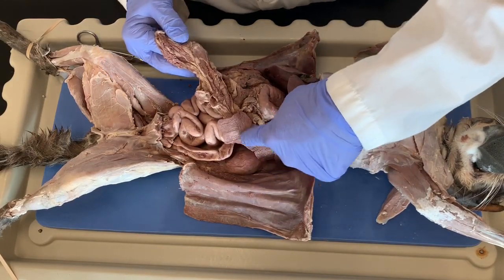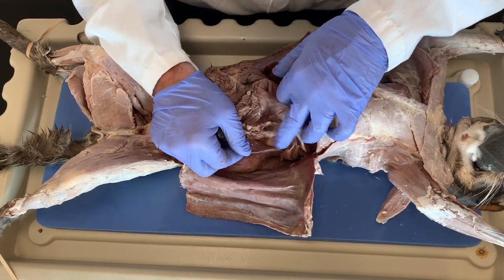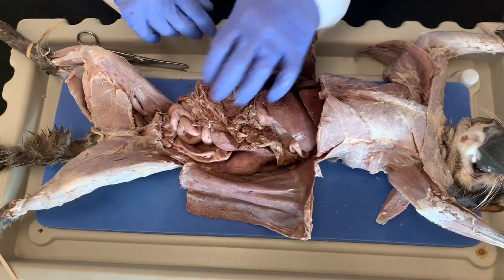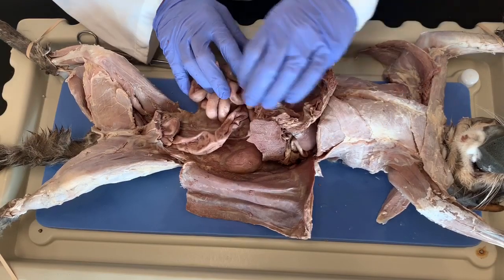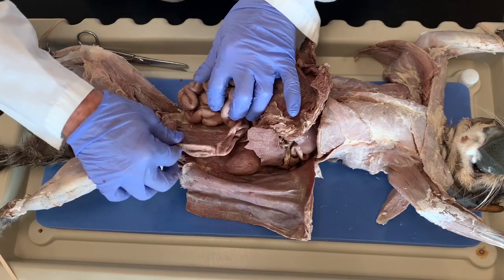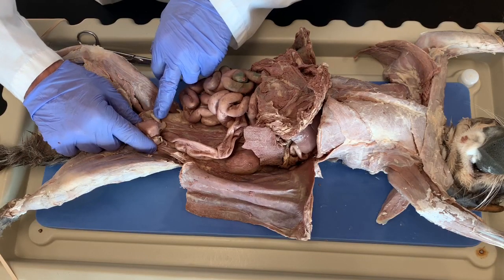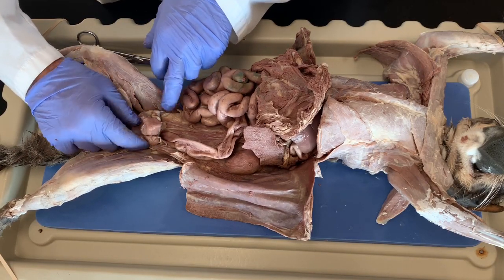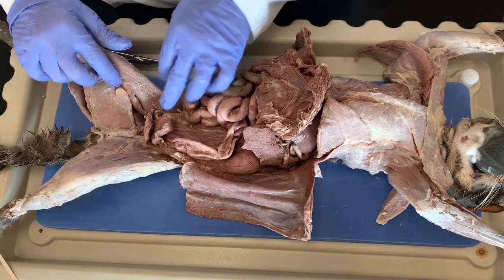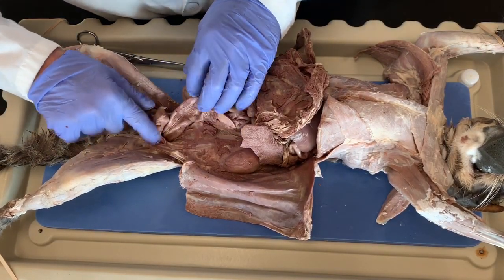So here is the spleen. We have the pancreas right in here. Okay, the pancreas is kind of like packed underneath the spleen, kind of partly in the first turn of the small intestine. And then this is all small intestine in here. And then this bigger tube is the large intestine, the descending colon that goes all the way down to the rectum, okay? Here we have the bladder, and then on the side of the bladder is these fat nodules, which contains the prostate glands, okay? So this is a boy, and so there's no uterus here, okay?